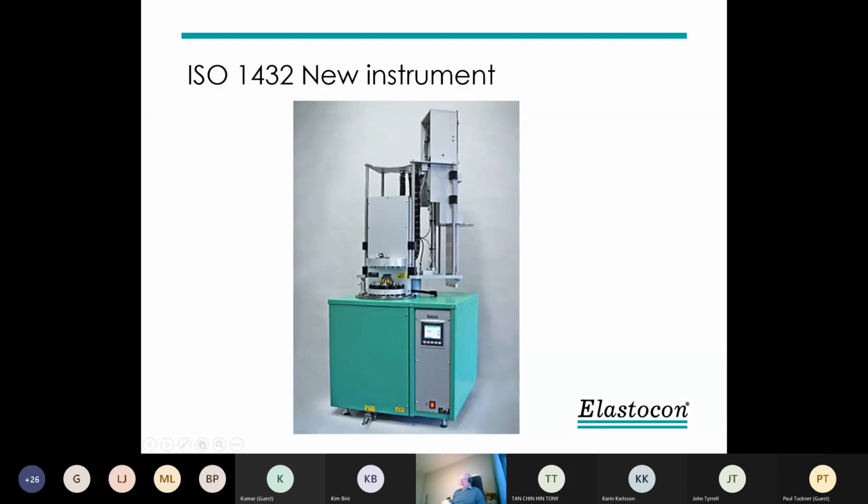But one thing we often recommend is that you also have a low temperature freezer, say a freezer down to -85, and then you can pre-cool the ethanol, because then you don't need to use so much liquid nitrogen. And if you're running just a single test one day, you don't need the nitrogen at all. You can just use the pre-cooled ethanol. But you have to fill the bath twice. First one time, take it out, and then another time to get down to minus 75 or 73.